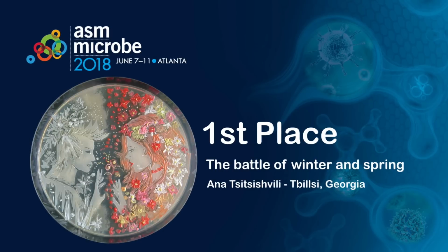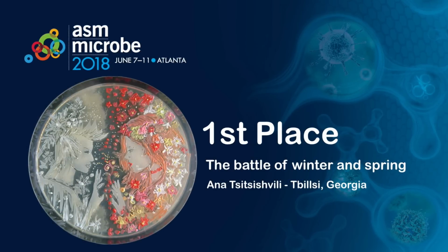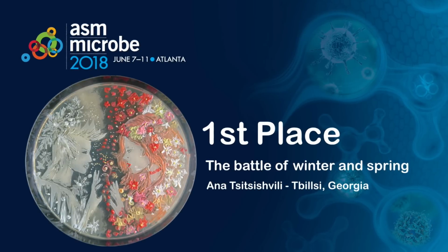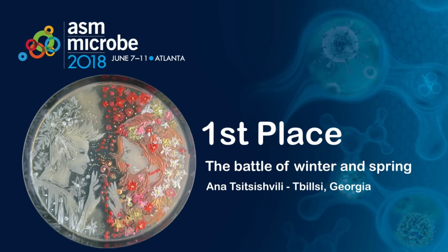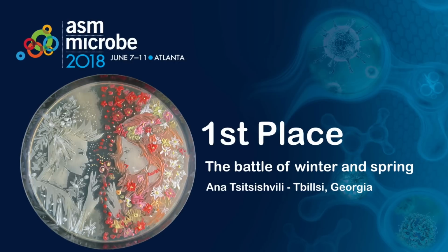So this agar art depicts, I think it's very cool, it depicts winter on the left in white, and the bacteria that make up the winter half of this plate are retreating from these red flowers made of Serratia marcescens. And that happens because the Serratia are secreting antibiotics that kill the white bacteria.